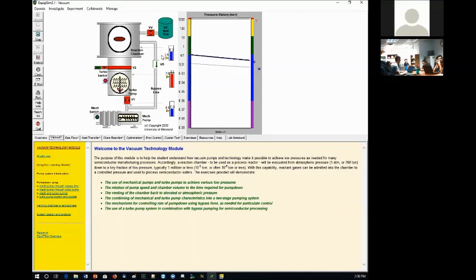The next thing we're going to do, we're going to close the bypass valve pretty soon. So once this reaches and stabilizes at the base pressure, I know that 2.6, right? 2.6 millitorrs. I will close this valve here. I'm very close.